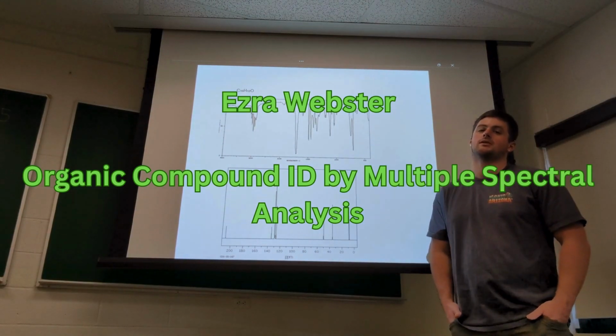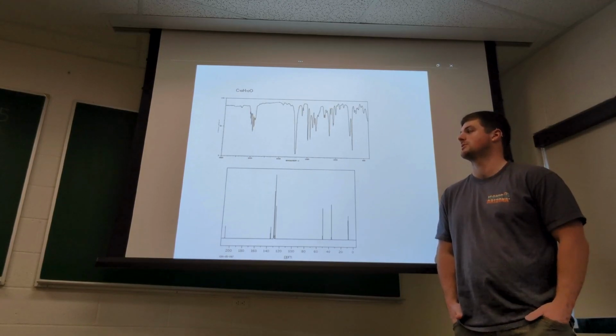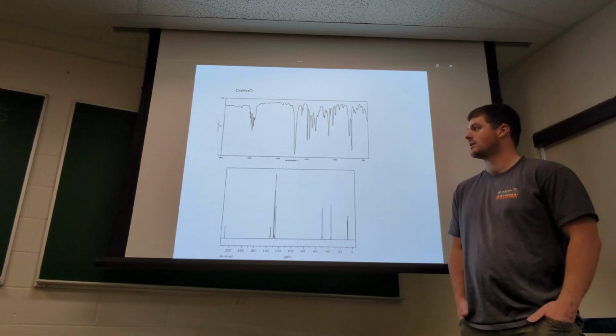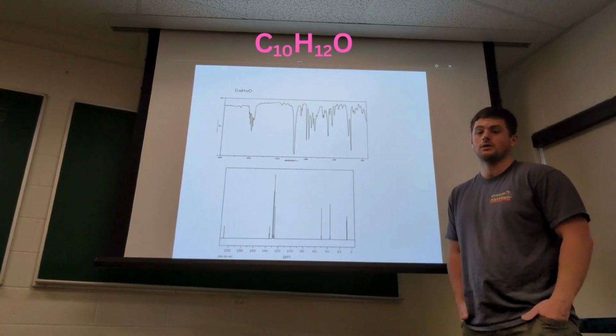This is my presentation on identifying a specific organic compound based on chemical formula and multiple spectral analysis. The compound I was assigned has the formula C10H12O1.